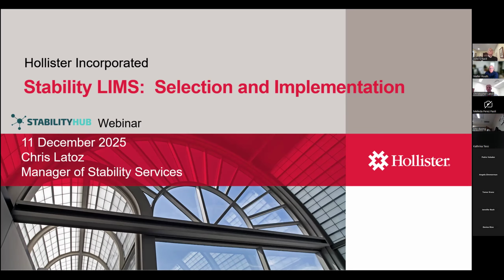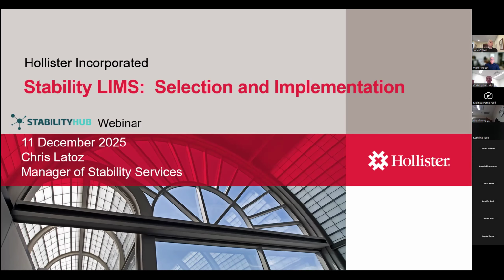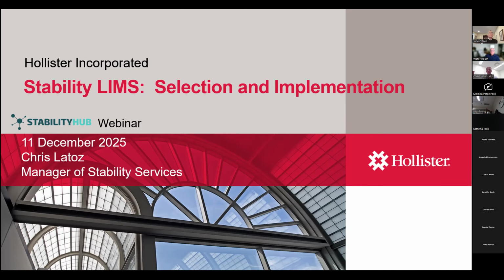Today's topic addresses stability LIMS from the viewpoint of the end user, and our panel includes stakeholders that have contributed significantly to various aspects in the process of converting from a manual to digitalized system or updating from one system to another. So before we get too far, I'd like to introduce the members of today's panel.